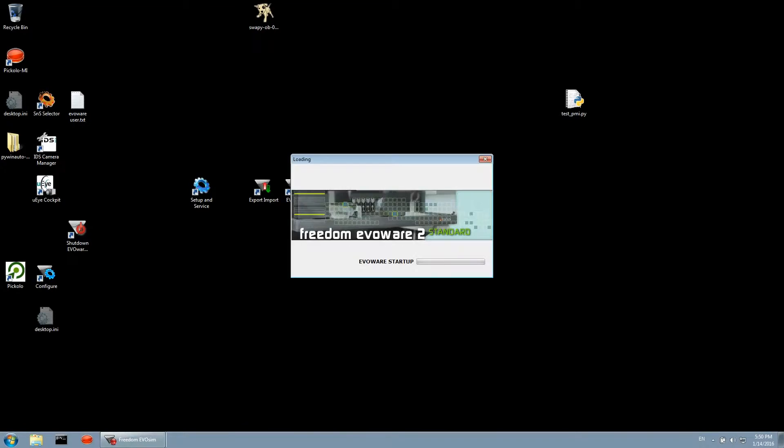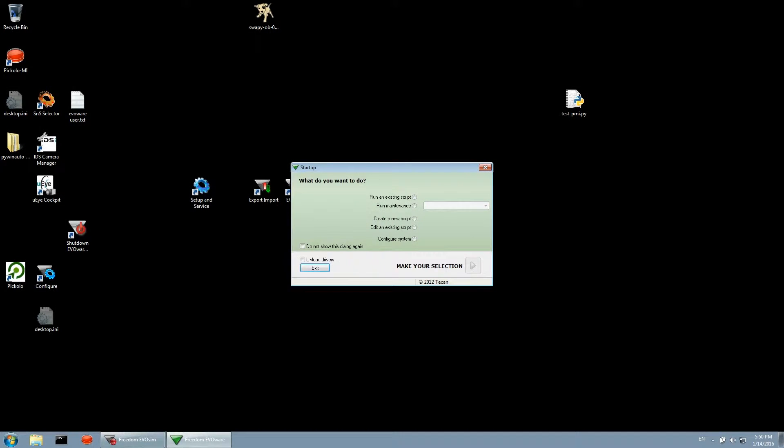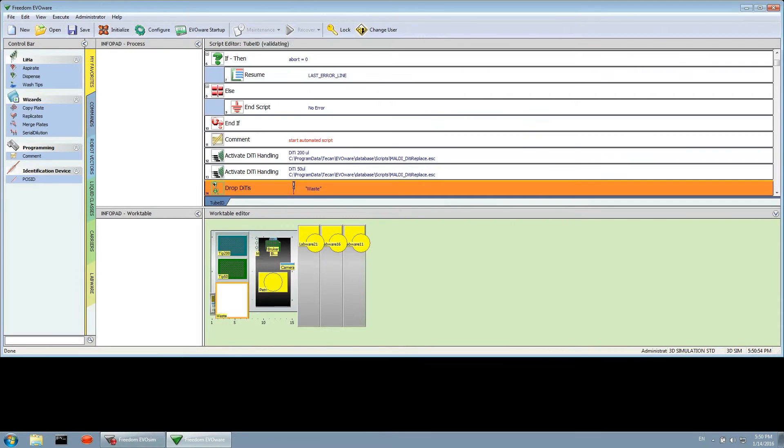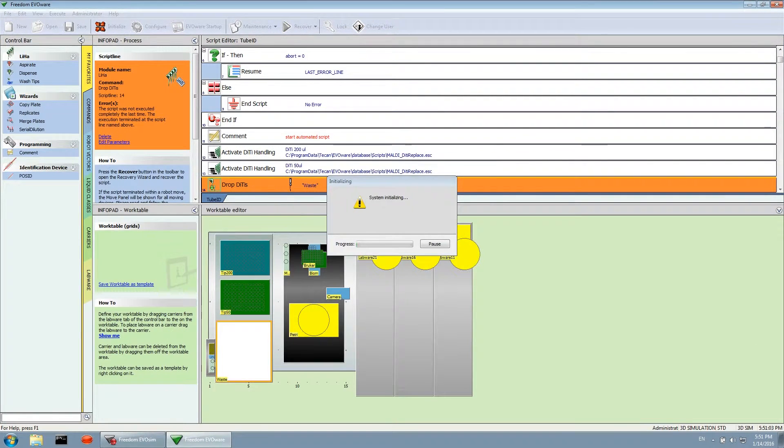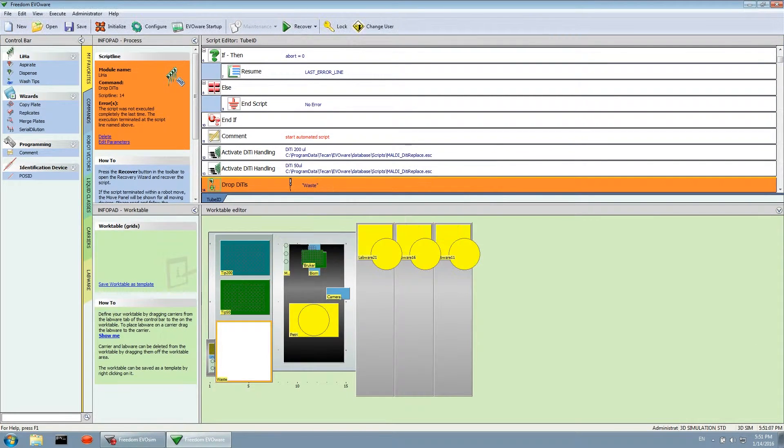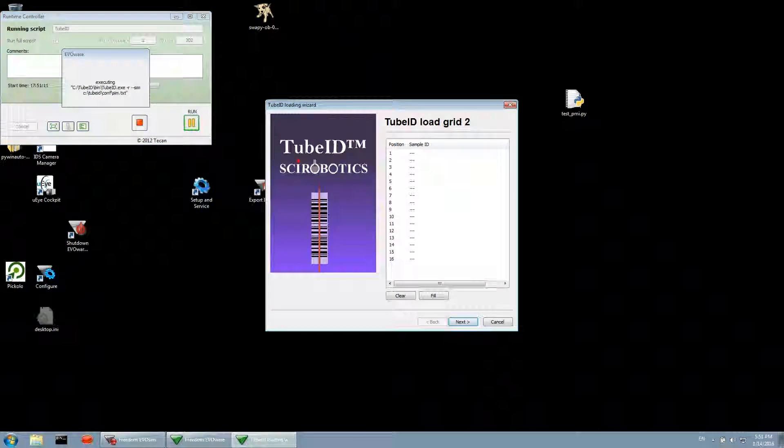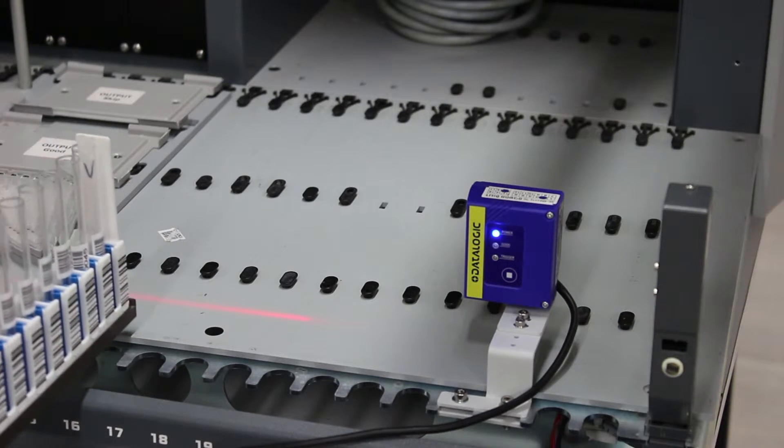To use TubeID, we'll have our Everware script launch the TubeID software at the right time. Once the TubeID software is running, we slowly slide the tube rack into its designated grid. As each tube is read, an audible indication will be given.